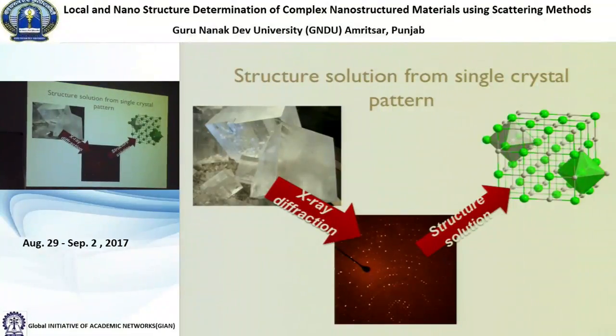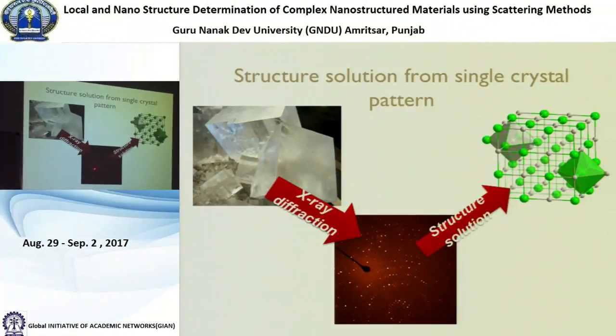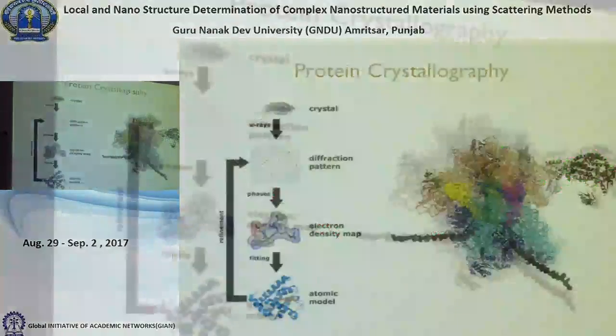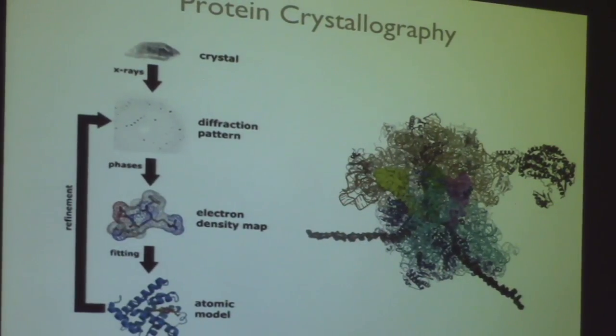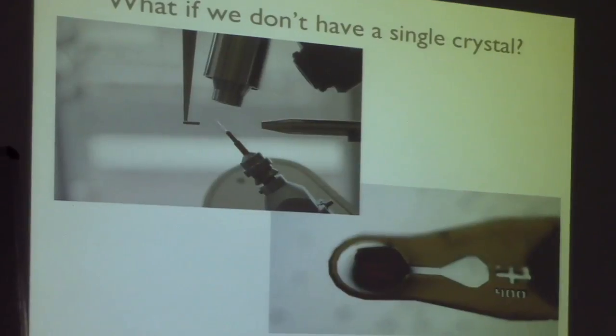If you're going to do structure solution, the approach is you have your crystal, you get dots on your detector, and then you do structure solution. And it's really powerful. We can actually solve structures that look like this now. Not me, but people.